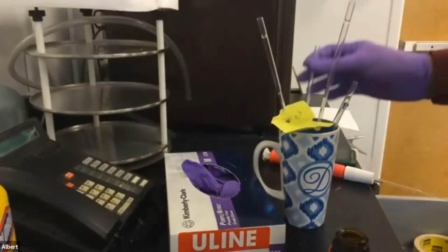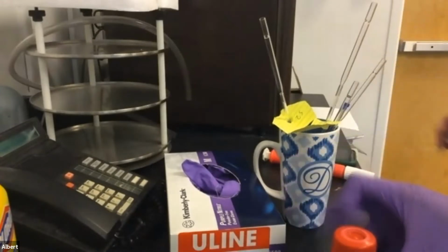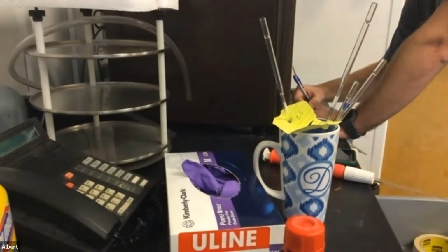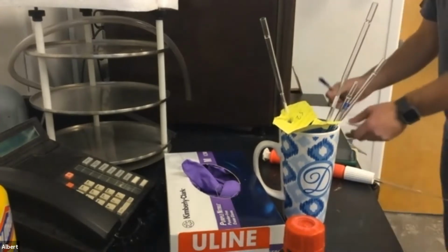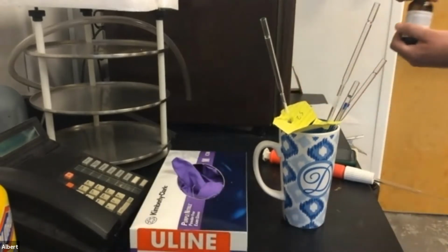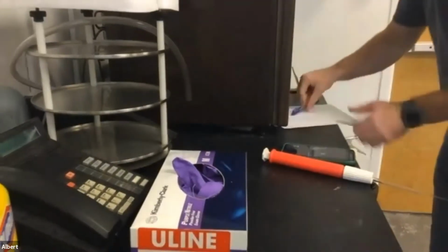So that deuterated chloroform is a pretty expensive solvent. And what you're going to find out is that when we run the NMR, it shows up at a specific place in the NMR. So the solvent shows up at about 7.24 parts per million. So we're going to bring out, can you put that back in the food? It's 7.24.